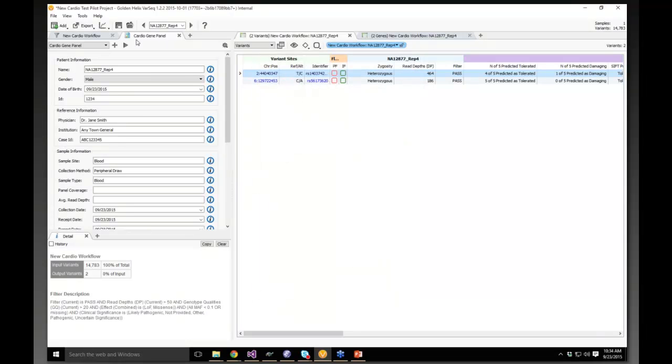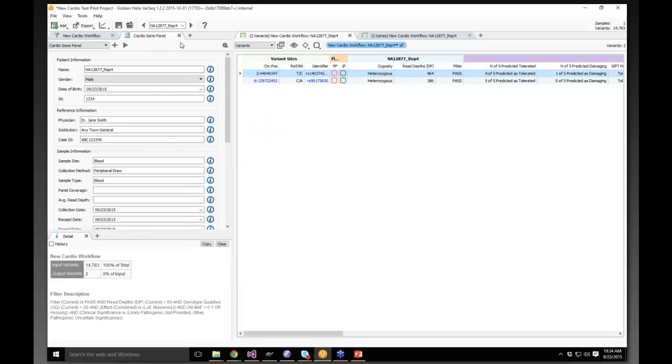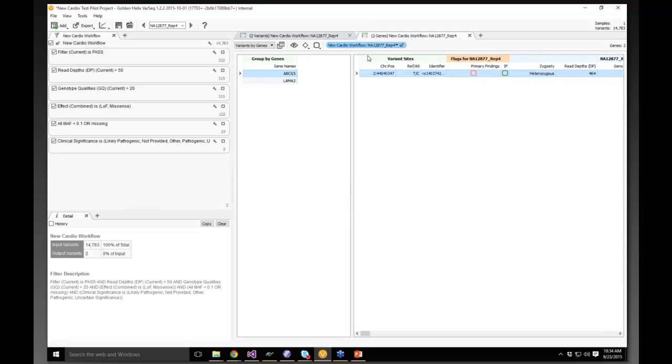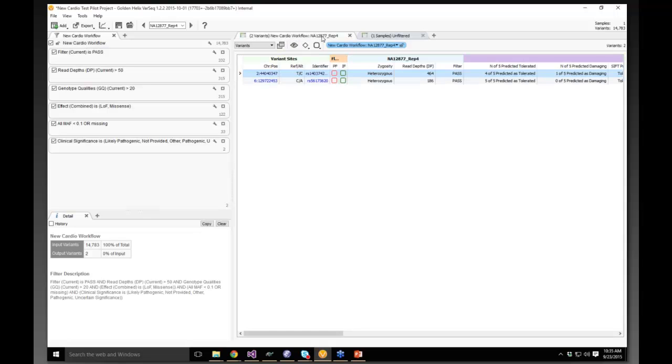So now I can have all that prepared, and I can do a quick test to see that I'm getting a reasonable report off of that. If I'm happy with all that, I'm just going to say that's good. I just want to keep the focus on this as people get started. And again, I can tweak other information about different tables. I could have a table focused on a gene level view versus a variant level view, a sample level view for things like adding in those coverage statistics, which I'm not going to add in now for the sake of time, but it's also something you could put into your workflow.